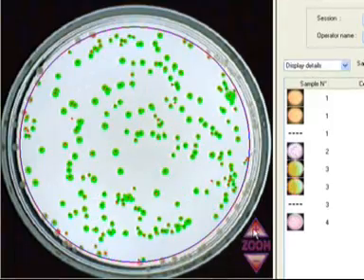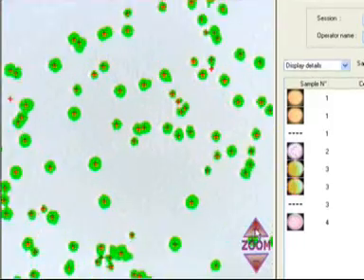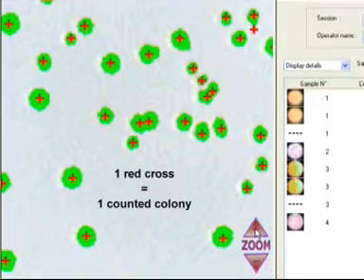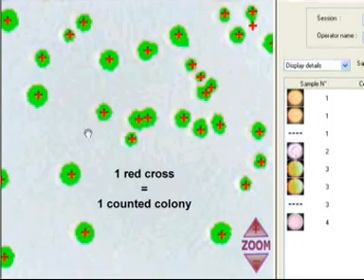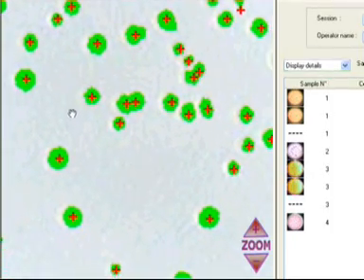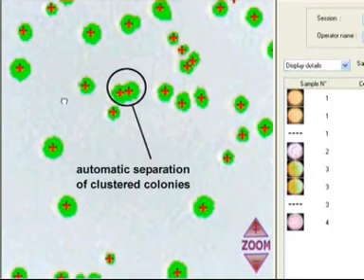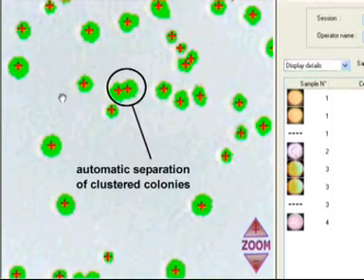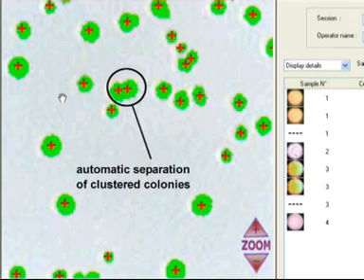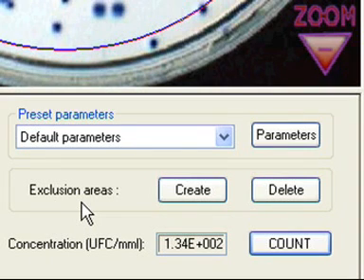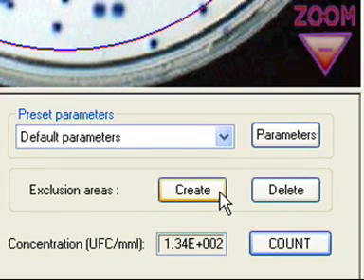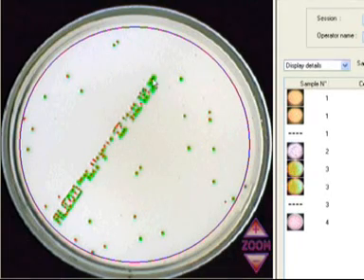Zoom in on the image. Each counted colony is marked with a cross. The separation of clustered colonies is automatic. Create your own exclusion areas to avoid unwanted counted elements.